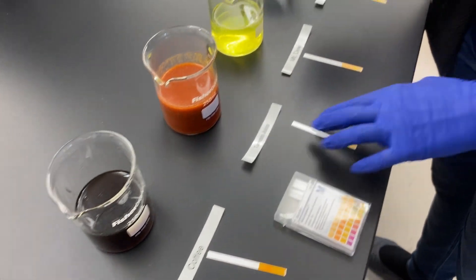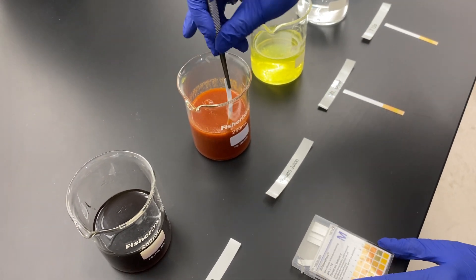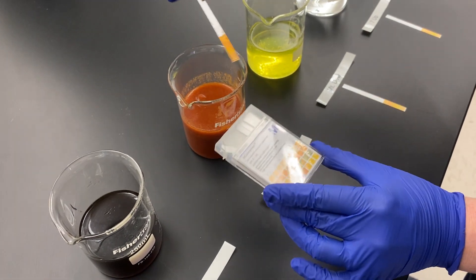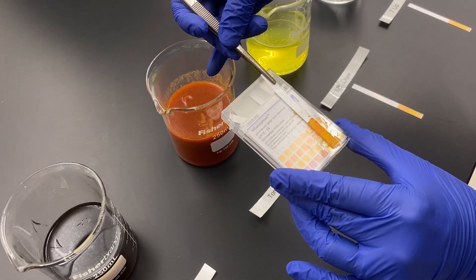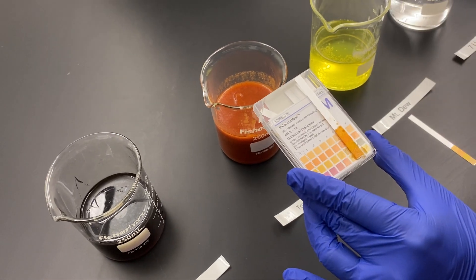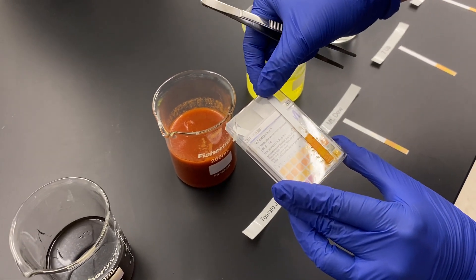Next we're going to test tomato juice. Sticking the strip in and removing the excess solution, comparing it to the chart, that looks a little bit darker than coffee. This bottom color is a little closer to 4, so tomato juice would probably be closest to a pH of 4.